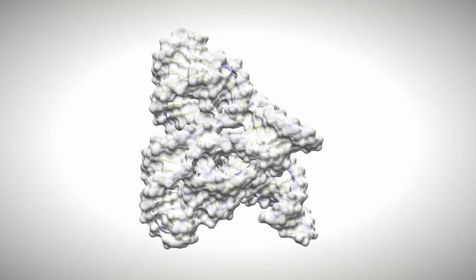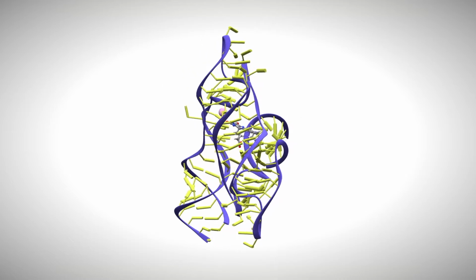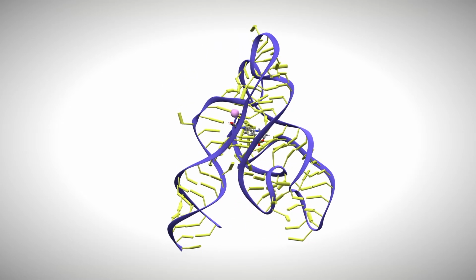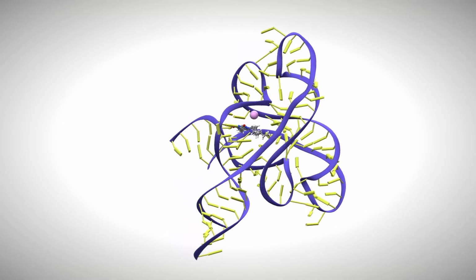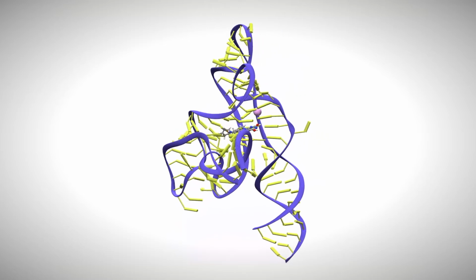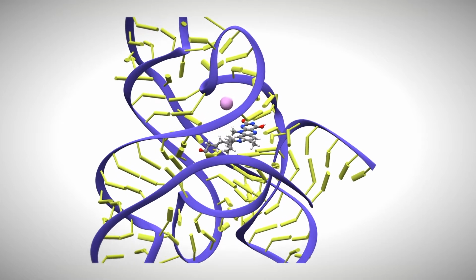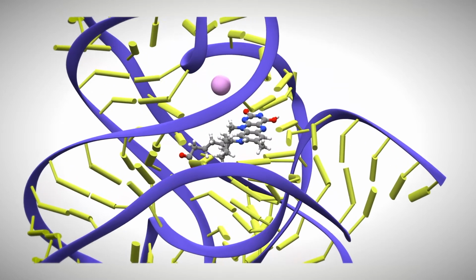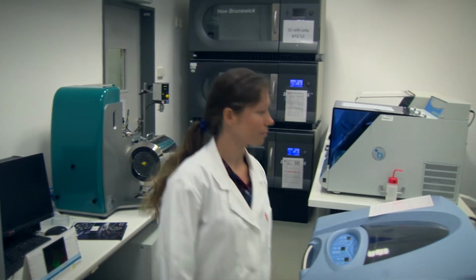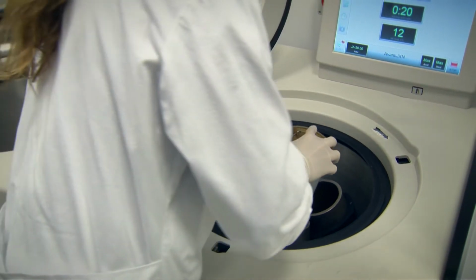The possibility of biomolecular structure determination, which became available in the second half of the 20th century, opened up a new view on biology and helped us understand many key processes in life. Nucleic acids and proteins display fascinating architecture wherein molecule function is encoded. But the path to solving a molecular structure is lengthy.